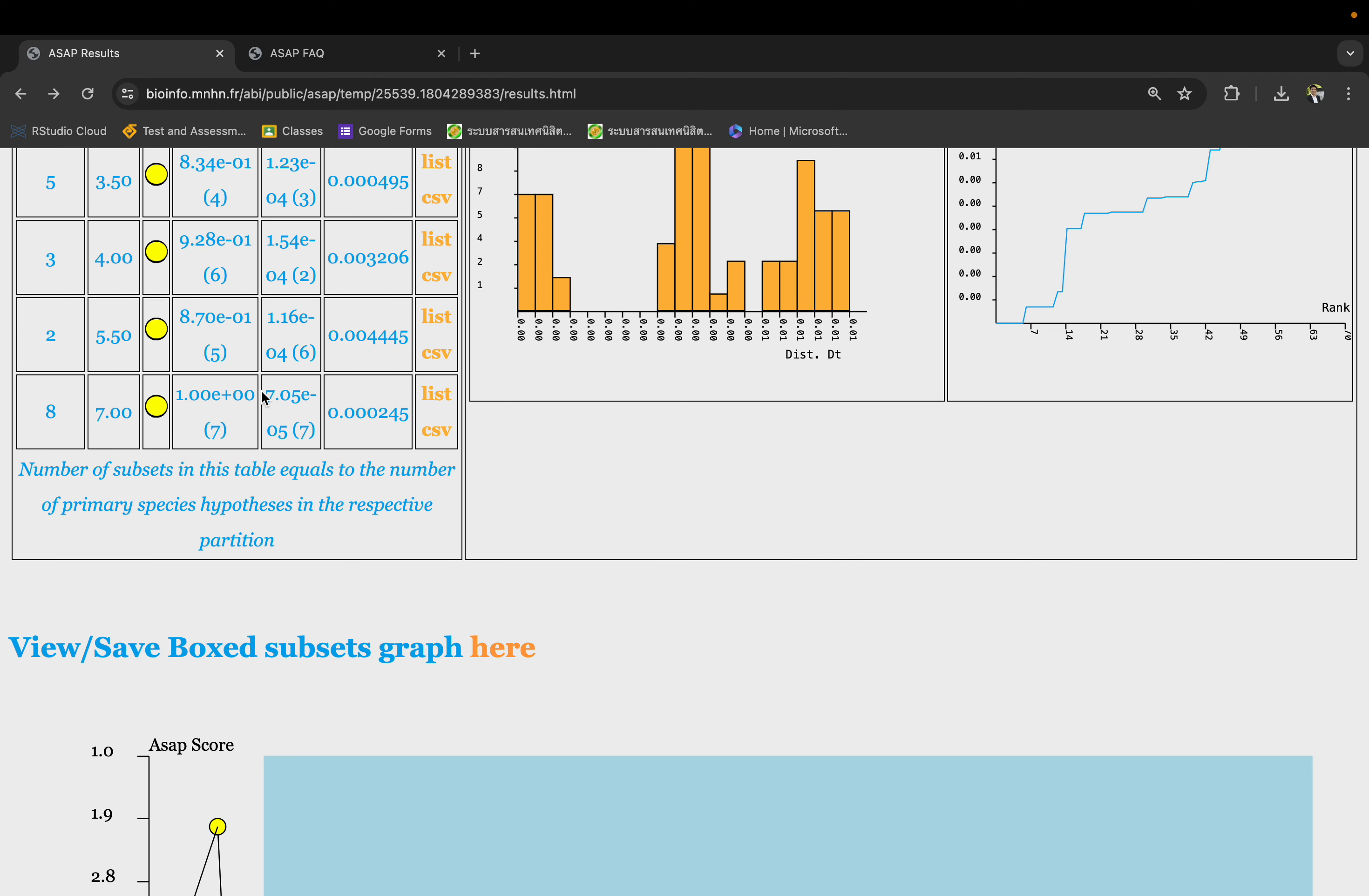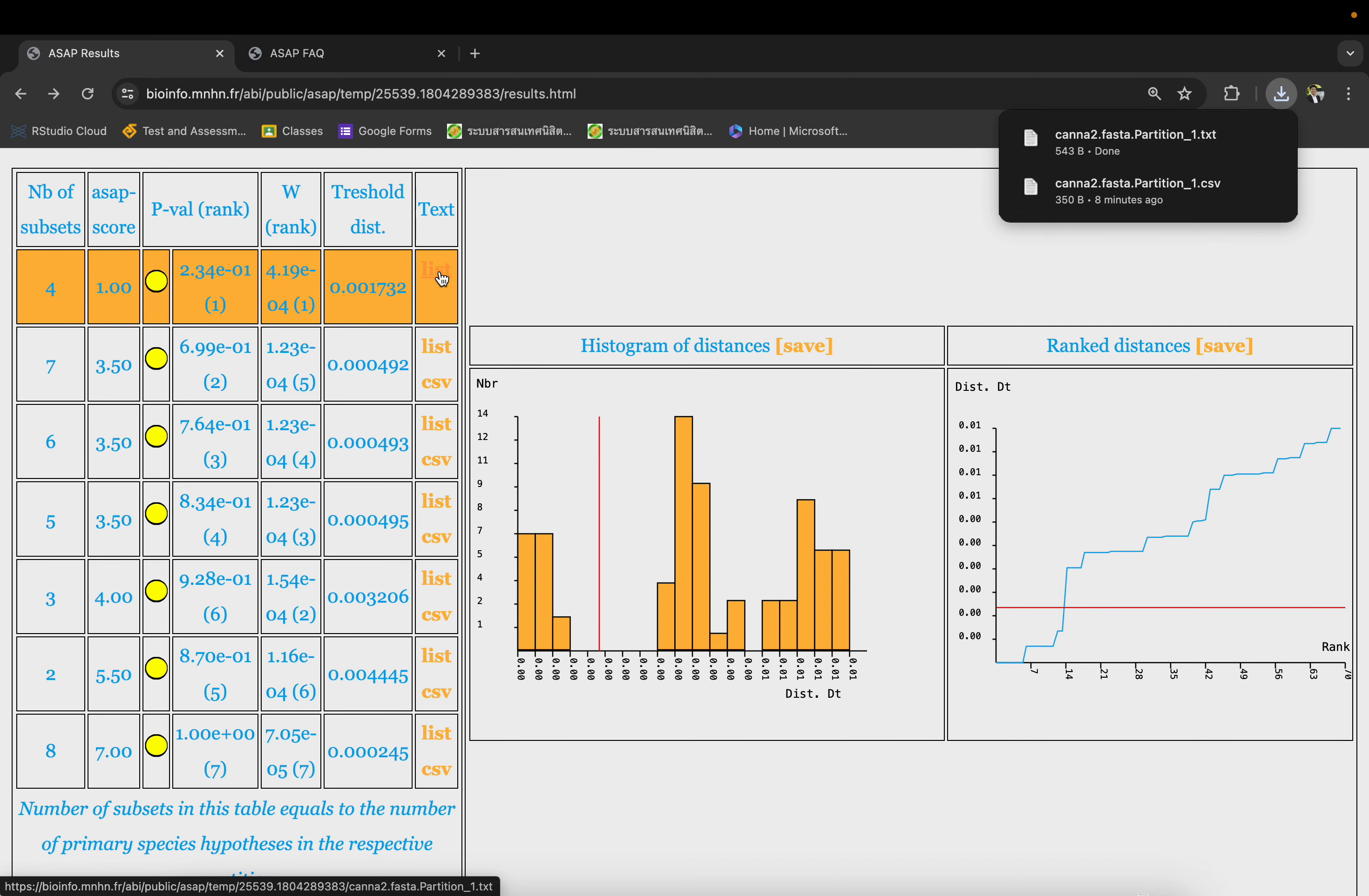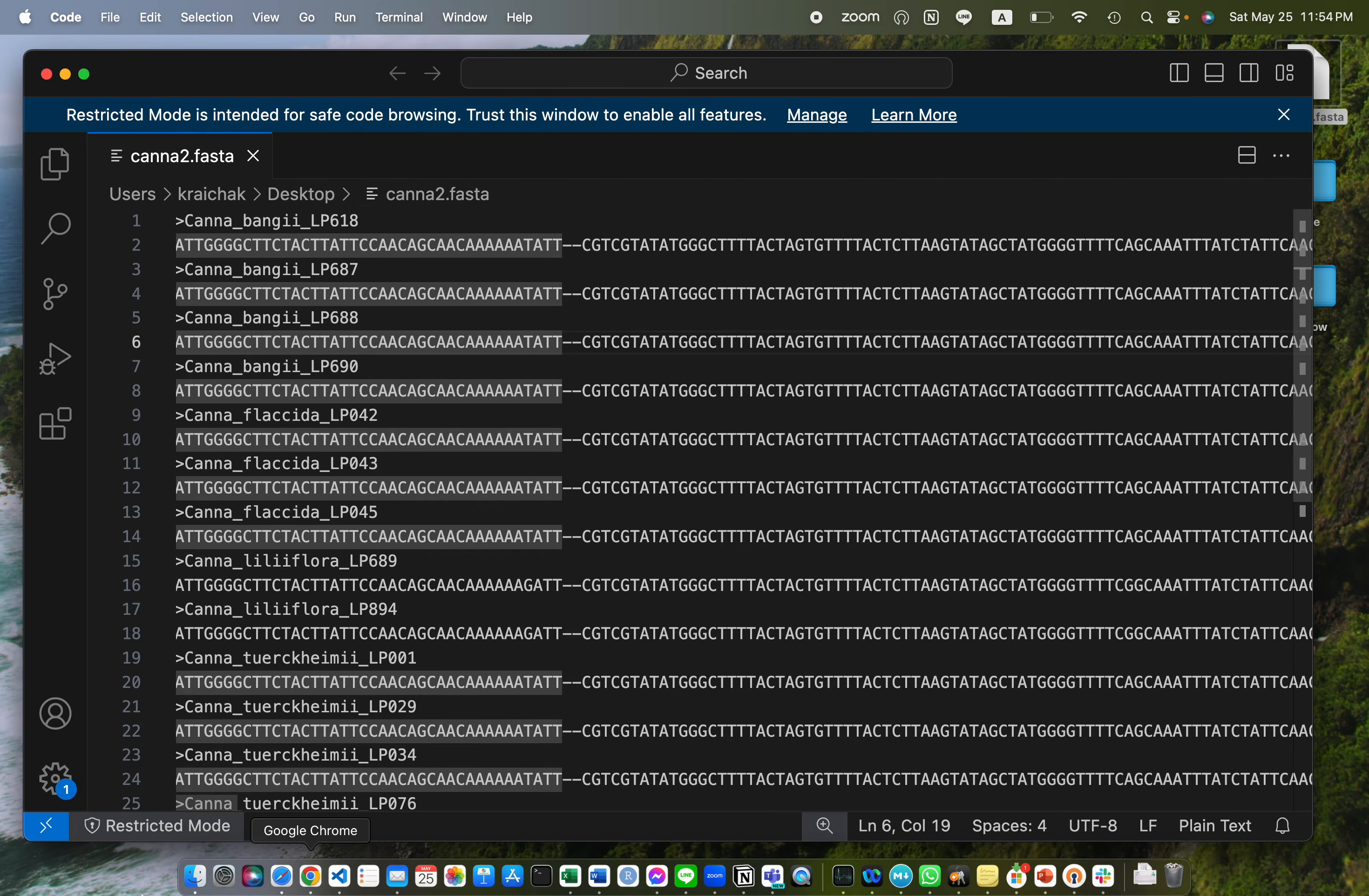If you have a hard time looking at that, you can always click here at the list or CSV. This will download the result into text or CSV format. Then you go back to your downloads folder.